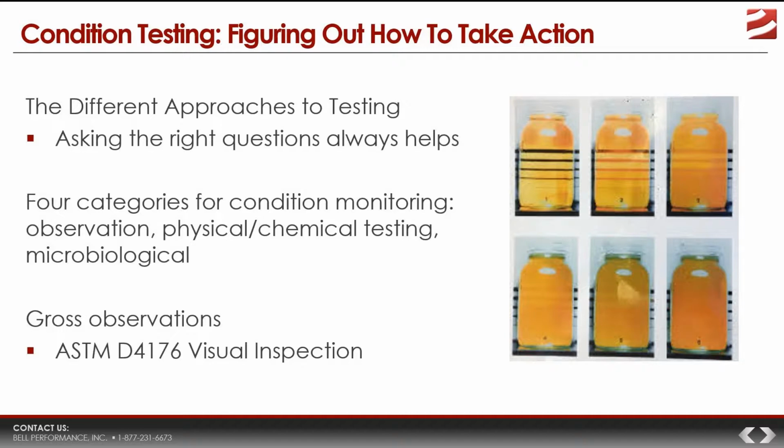So if the stored fuel doesn't pass this visual clarity inspection, well, that right there is a pretty excellent indication that there is something amiss with the fuel. This is the simplest test to run, and if it doesn't pass this, then it's pretty clear that you've got problems.